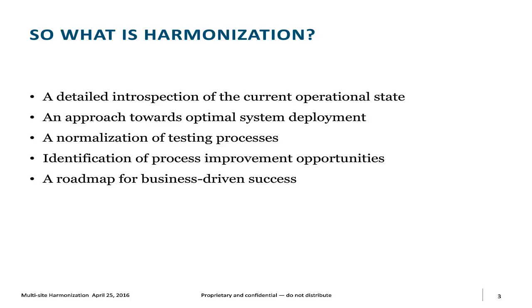Now, where the differences typically will appear are how samples are handled at specific sites, because there might be certain constructs within the site itself and how samples are brought to a laboratory and how they're logged and so forth. And we'll be talking about those when we get down into the workflows.